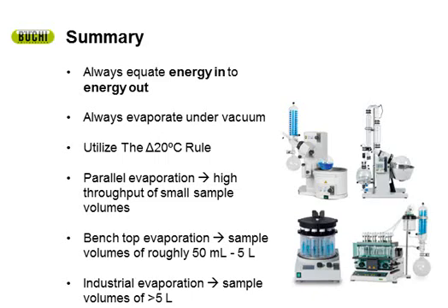Okay, so it looks like there's a bit of a mix between D and A. The correct answer is A. It's to evaporate at a lower, more gentle temperature. That's the most important factor when you're utilizing a vacuum source.